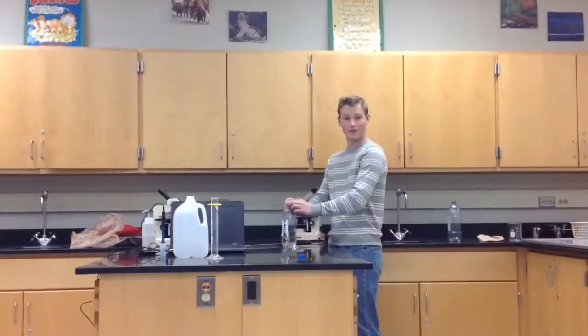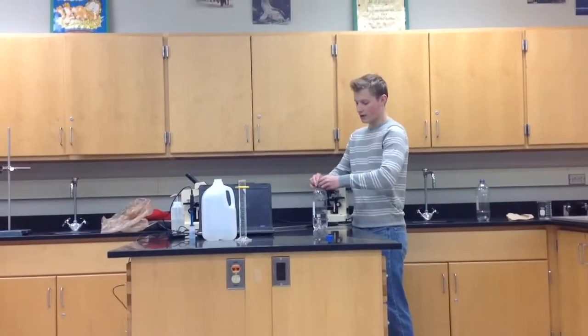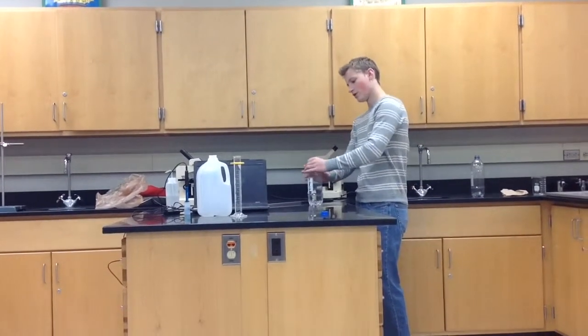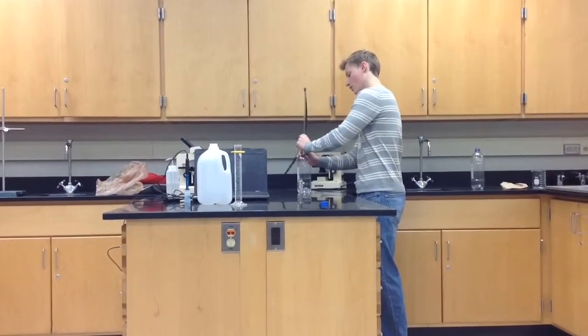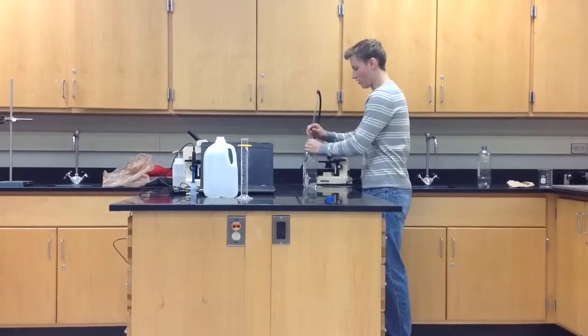We're on to the second half of the experiment. We're going to be using methane instead of CO2 this time. And we've got another 400 milliliters of distilled water. So we're making our airtight seal with the paraffin. And we're then going to insert the tube, create our seal again.